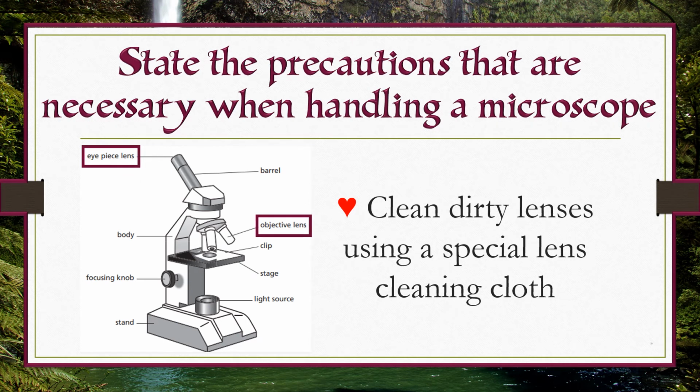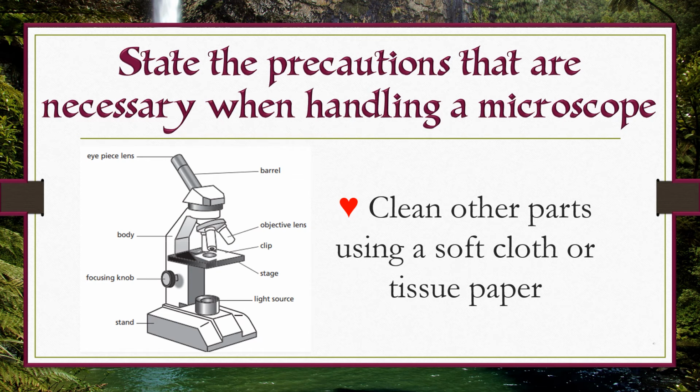Clean dirty lenses using a special lens cleaning cloth. Clean other parts using a soft cloth or tissue paper.